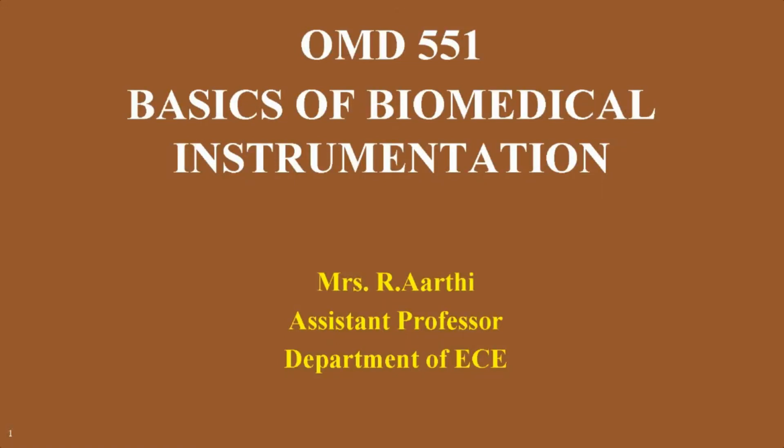Hello everyone. In this video, we are going to discuss colorimeters and the types of colorimeters.